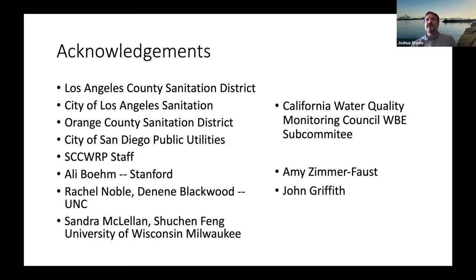The sensitivity they've found is getting down to around 1,000 copies per liter, which is about the sensitivity we can get to relatively easily. They could probably play around with volume and get higher. But as I briefly mentioned, we are concentrating 20 milliliters on a filter and getting a similar sensitivity to what they're getting with 200 to 500 milliliters. Thank you.